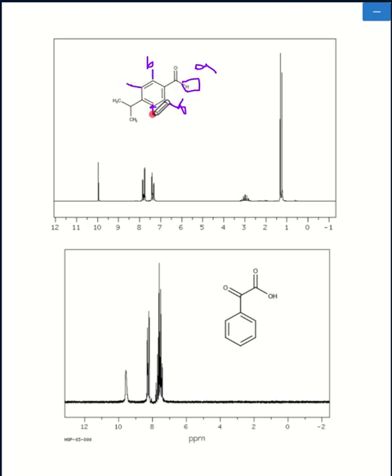These two carbon are going to be labeled C. And then, let's see, the hydrogen coming off of that carbon I will label D. Therefore, the two methyl groups right here and here, those three hydrogen I will label as E, because based off of symmetry, they'll get the same label because they're more or less the same carbon.